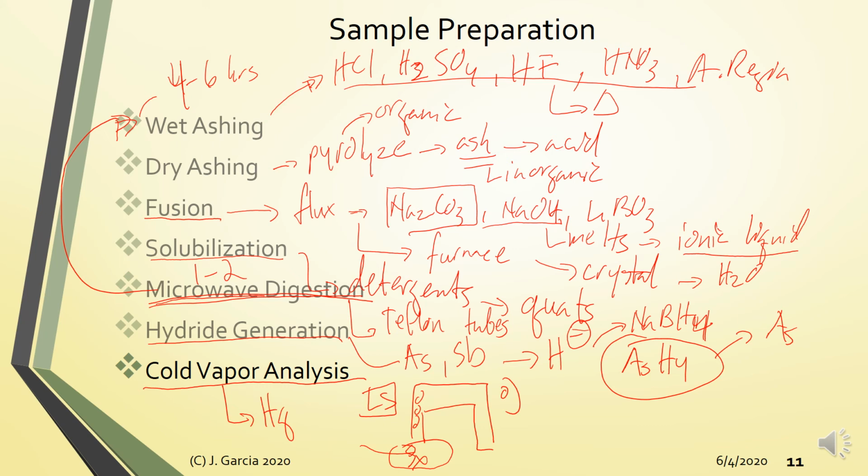So here, the air or the gas being pumped is actually pushing mercury vapors out of the solution and into the quartz tube. So here you don't need to atomize mercury anymore because mercury is now in its free atomic state. The mercury traveling inside the tube will now interact with the radiation coming from your hollow cathode lamp or electrodeless discharge lamp.